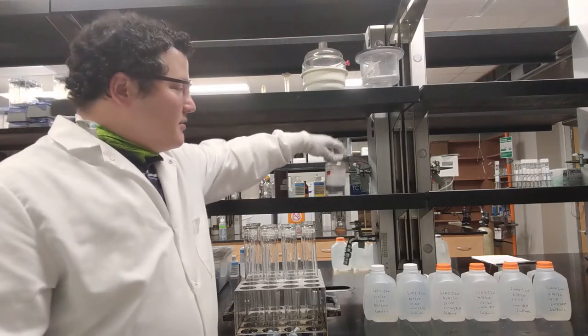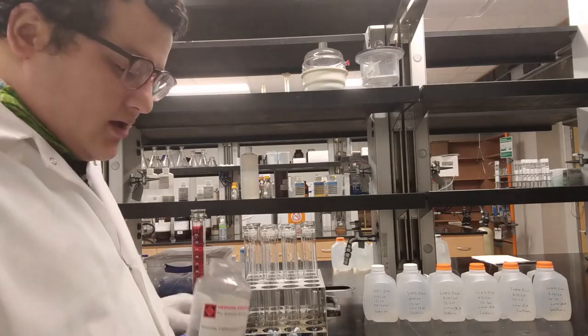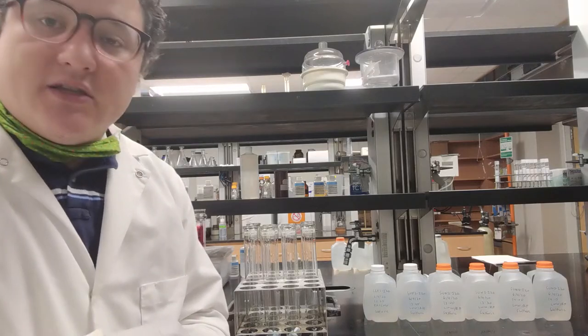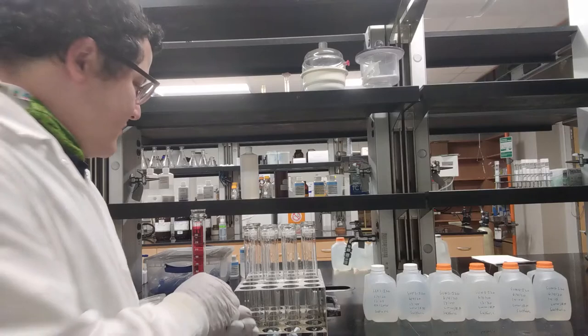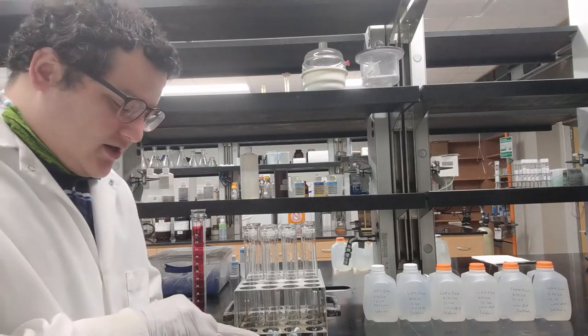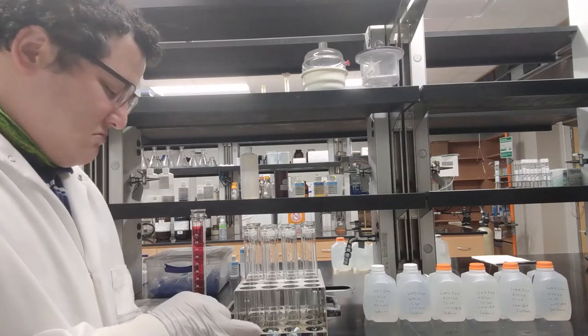And then a pinch of boiling chips. If you forget the boiling chips, then you're going to get a more violent boil during our reaction phase or our digest phase, and you may lose some of your sample in the process. Just a pinch — that's all that's necessary. You don't need to measure out how much, just a little bit.